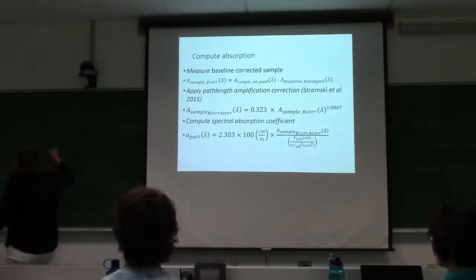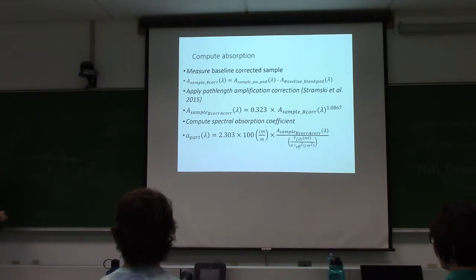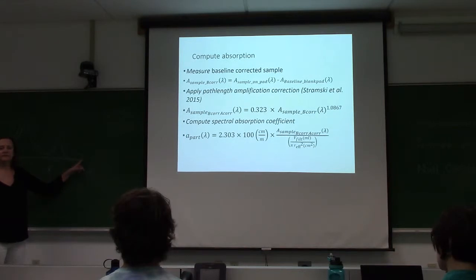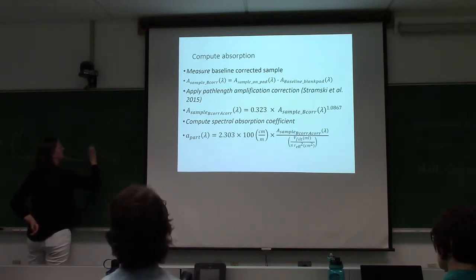The way that we know is because if we measure the absorbance in an integrating sphere of, say, a culture, I'm measuring out to here. It looks like this. If we measure it in transmission mode, we get this. And phytoplankton don't have absorption out in the infrared. And in the integrating sphere, because we collect all the scattered light, we can validate that. But in transmission mode, we have this signal here, which is scattering, but it's methodological.